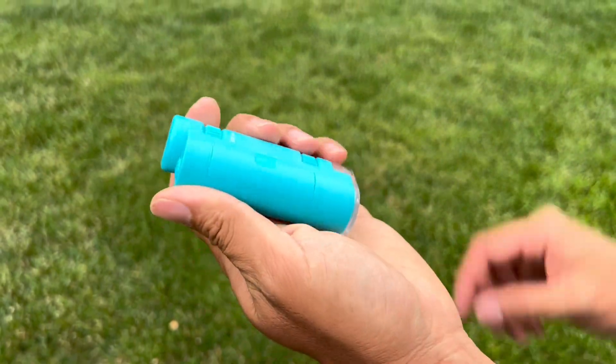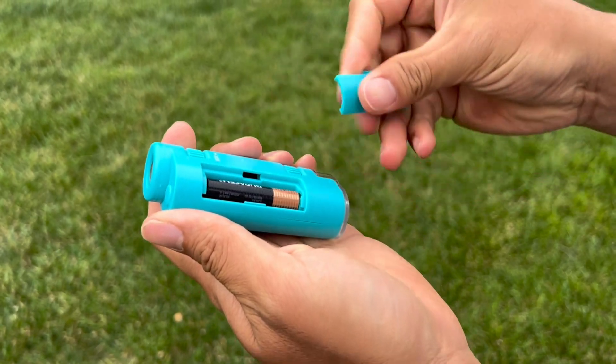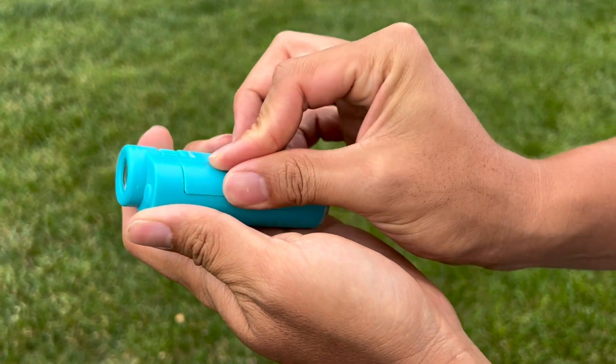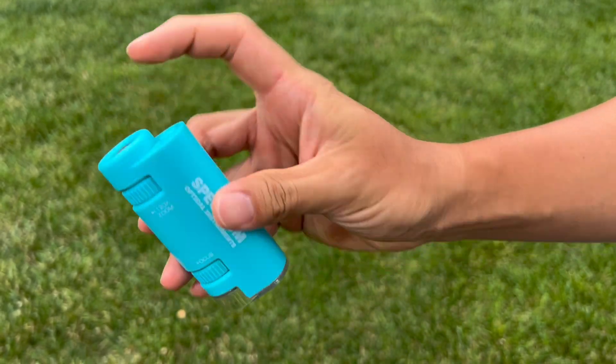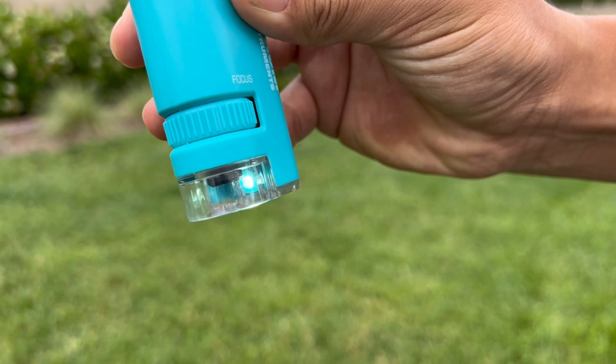To observe objects around you, first install the battery and switch on the microscope by pressing the on-off button on the top. Press the button once to activate the LED light at a low level, or press it again to switch to a high level for observation in low-light environments.